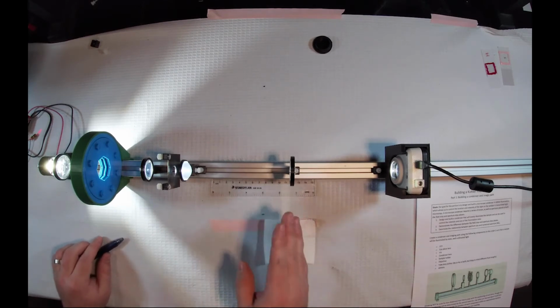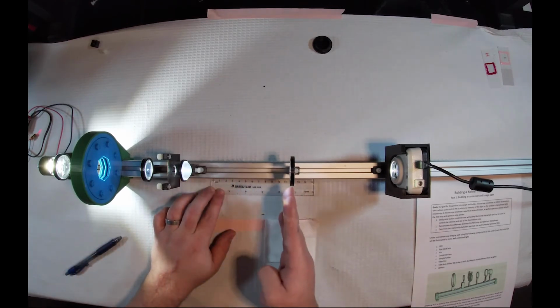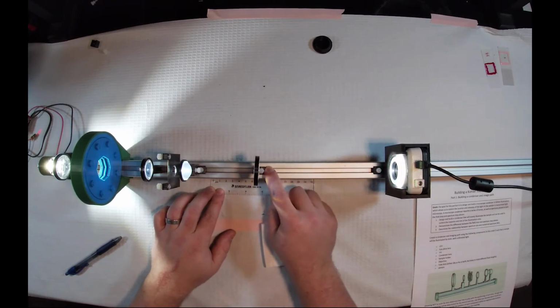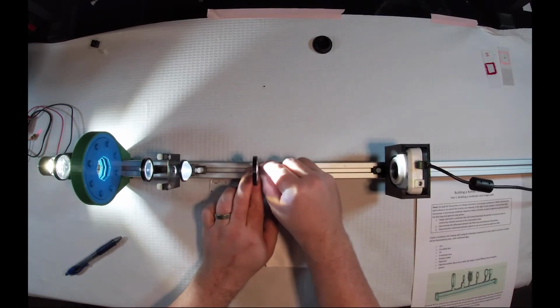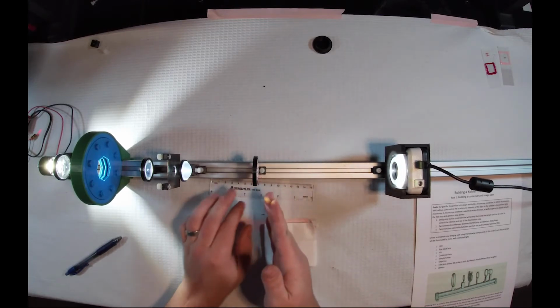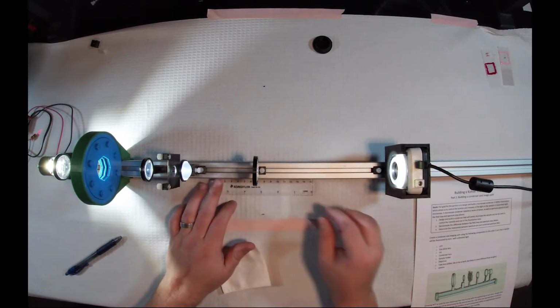So this guy has a focal length of 70 millimeters. So we're going to make sure that from this back focal point, this is mounted 70 millimeters away. So that's going to be about here. And I will lock that down. Again, if we had used the 300 millimeter focal length one, it's going to need to be mounted a lot farther back. But for this lab, we're just going to be using the 70 millimeter focal length lens.